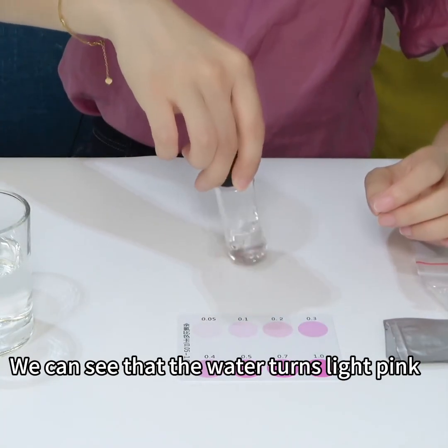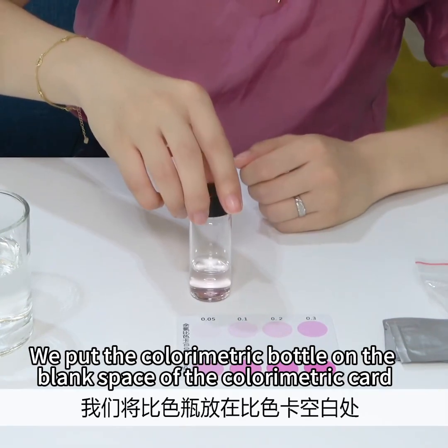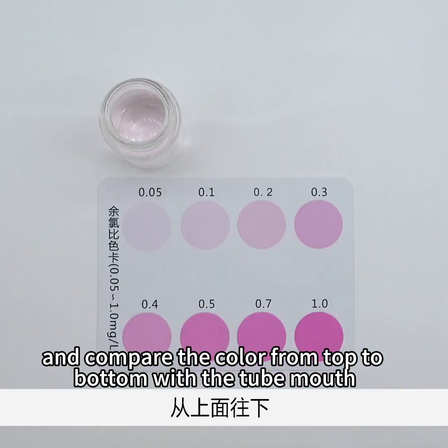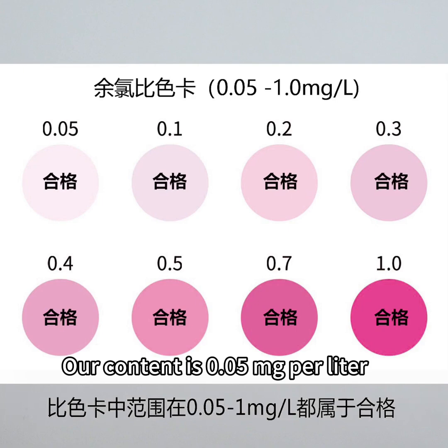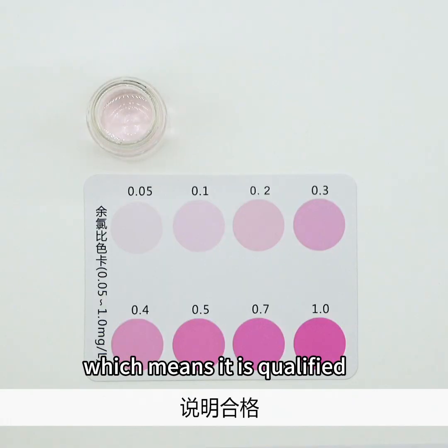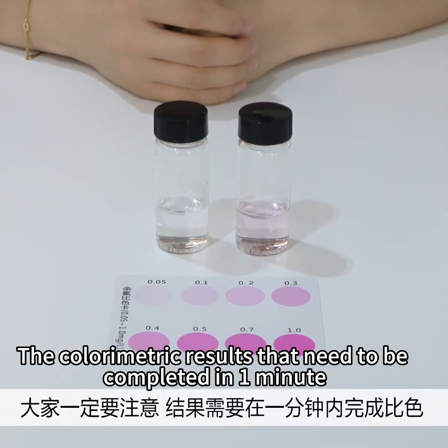We can see that the water turns light pink. We put the colorimetric bottle on the blank space of the colorimetric card and compare the color from top to bottom with the tube mouth. The range of 0.05–1 mg/L on the colorimetric card is qualified. Our result is 0.05 milligrams per liter, which means it is qualified. The colorimetric results need to be completed within one minute.